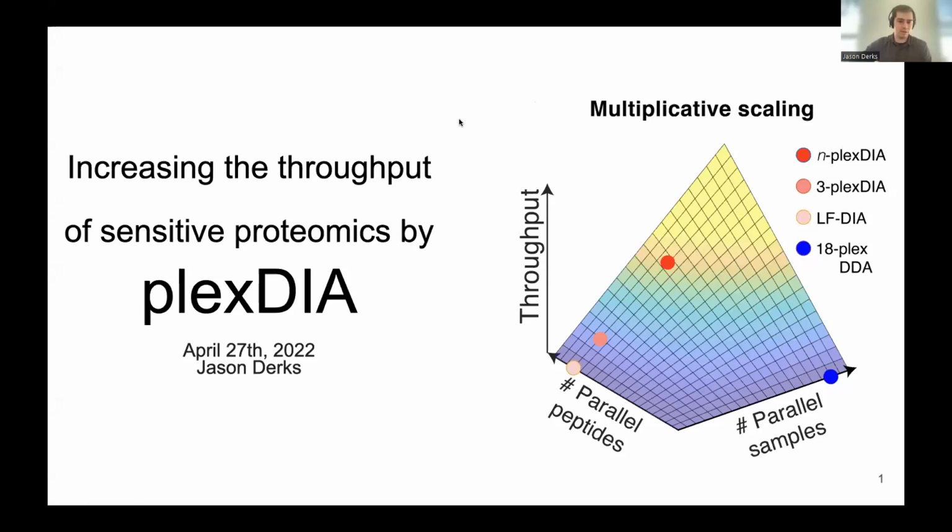Today I'm going to be talking about plexDIA, which is a method that we've been developing here in the Slavov lab and in collaboration with Professor Demichev. What this seeks to do is increase the throughput of proteomic analysis. And we do this by multiplexing data independent acquisition.